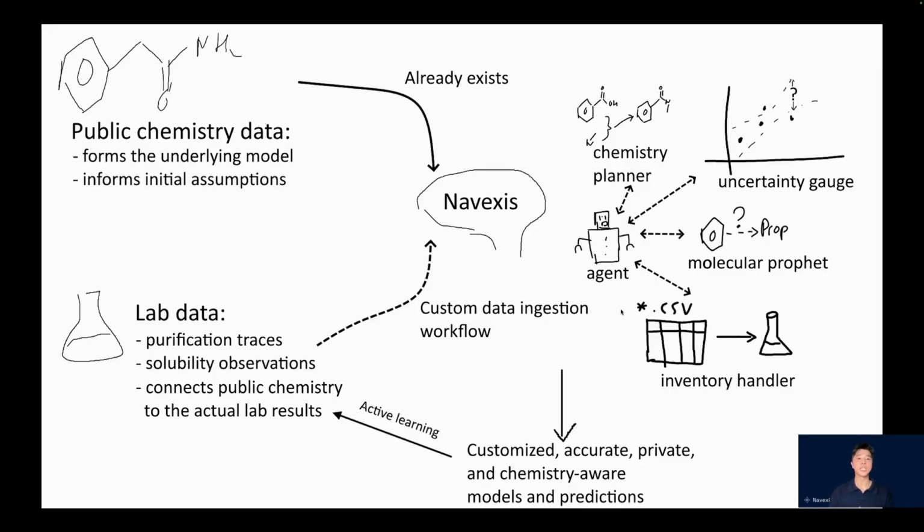With the agent, the chemist is able to get planning support as the model knows what is available in the laboratory rather than just suggesting pie-in-the-sky ideas, and can actually balance novelty with finding the correct compound with the best balance of properties. All of these tools, the data management, the synthesis awareness, the agentic planning, are not present in off-the-shelf programs and represent a real value addition on top of predicting molecular properties.